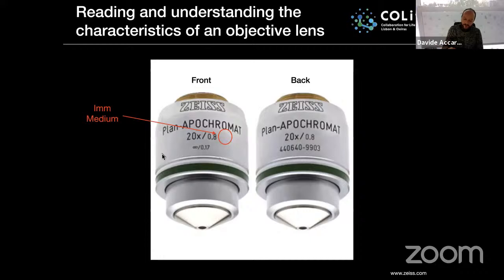We don't have the time to consider it. Again, please talk to your local expert. Then if we go further, we see this infinity sign here. So this means that the light collected from the focal plane of this objective will be actually sent parallel, so will focus to infinity, so we will send parallel after the objective.